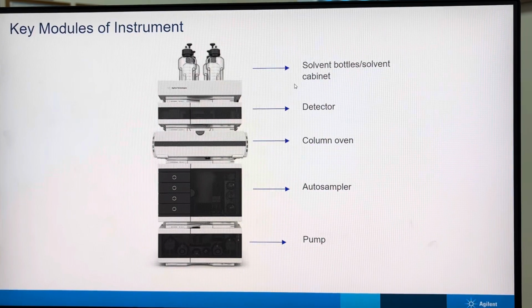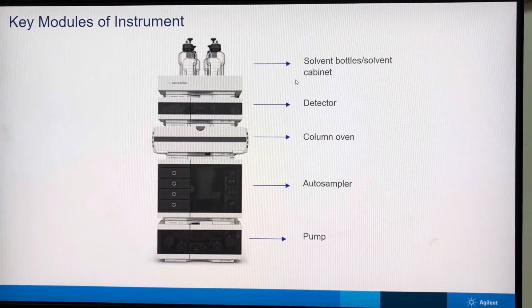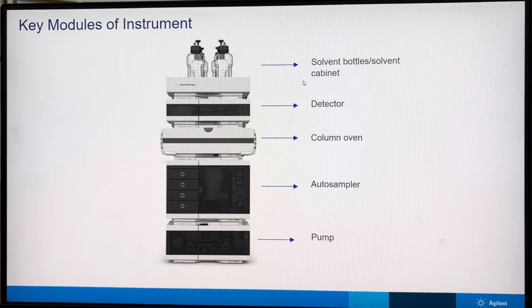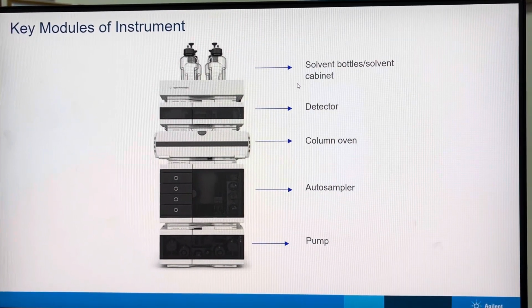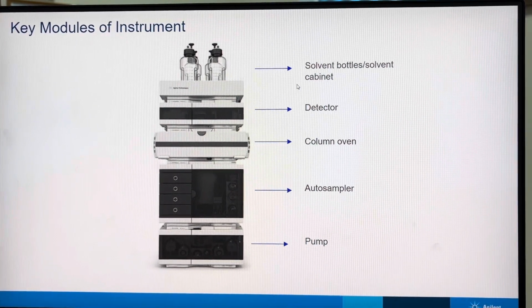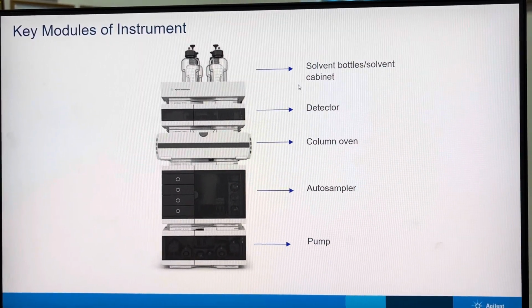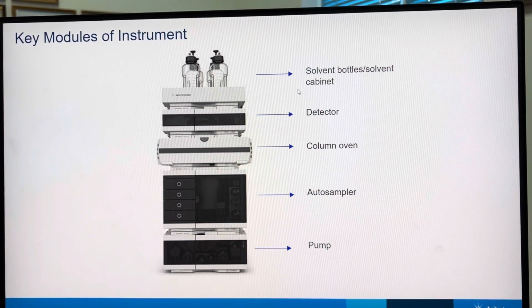If you see the design, even with respect to safety, these instruments are designed with stay safe caps so that the solvent will not vaporize. We'll discuss that. Also, the tray in which the bottles are kept is designed to be leak proof and can hold almost 8 liters of solvent. If there is a leak from a bottle, for safety purposes the instrument is designed so that it can hold 8 liters of solvent and will not leak.